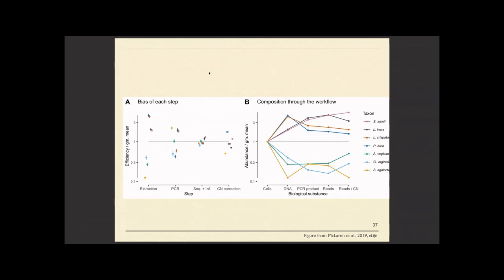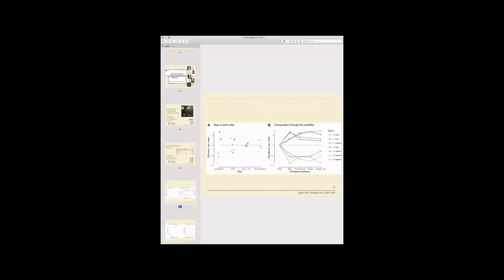Different components are going to affect the resultant efficiencies differently. Preliminary results seem to be that extraction efficiency is one of the largest components. So I would say take a lot of care in interpreting data obtained from different DNA extraction protocols. I'm happy to follow up on that as well.